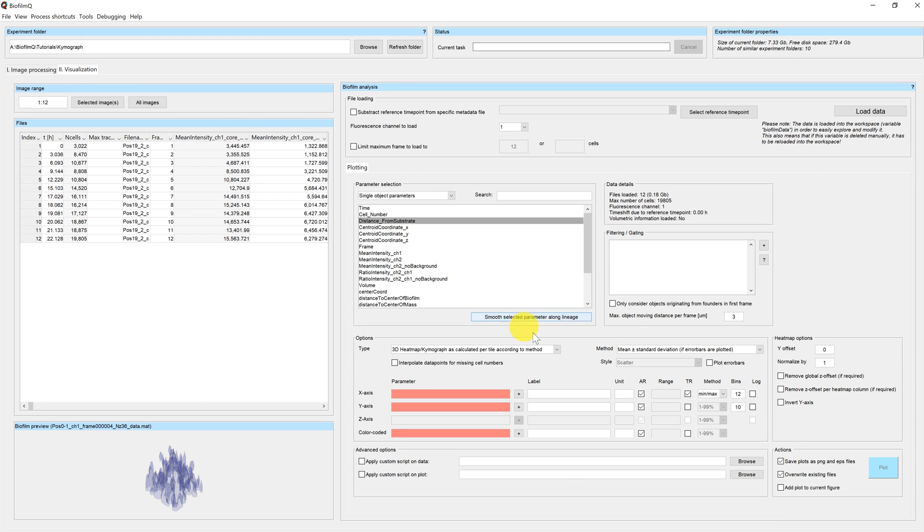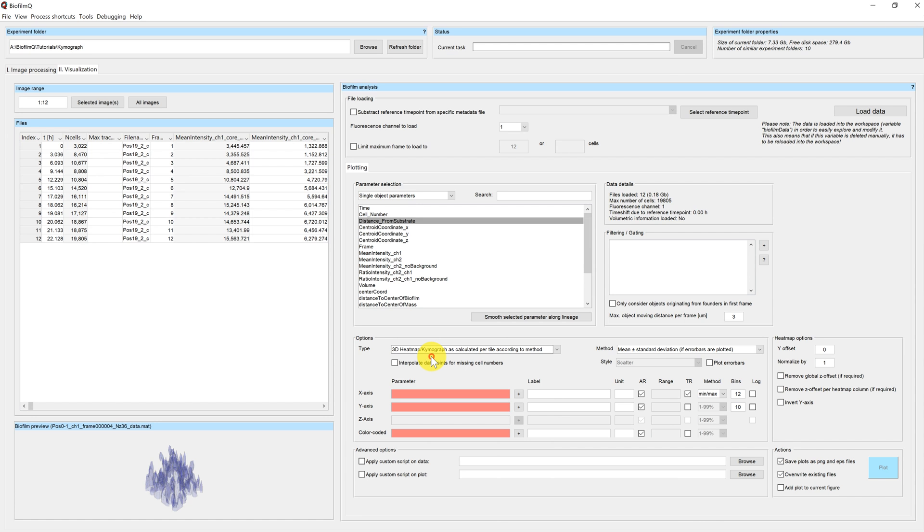We can do so by selecting the plot type 3D heatmap kymograph. And when you do so you will see that the heatmap options over here become active.